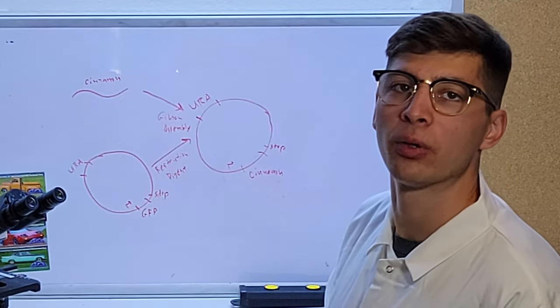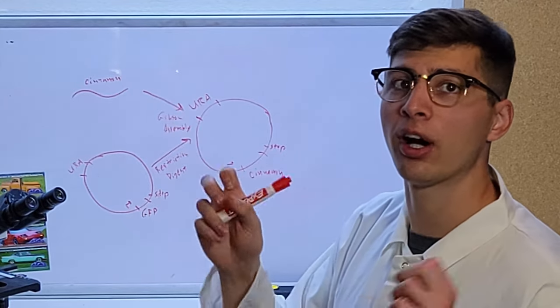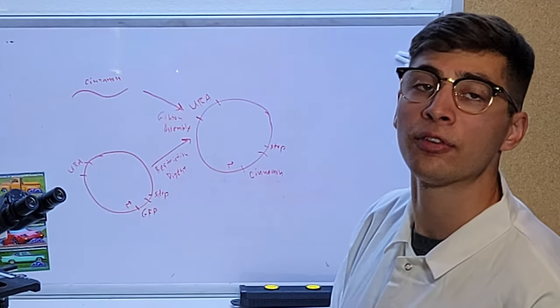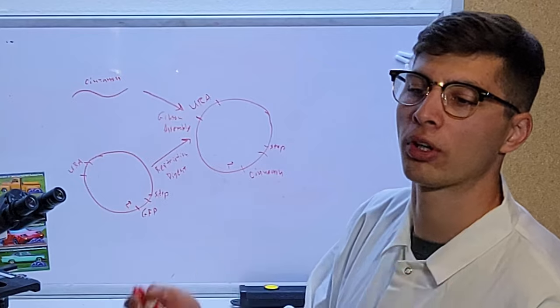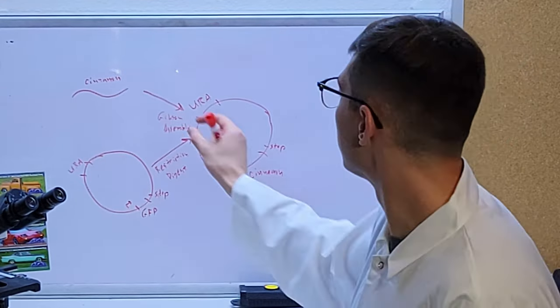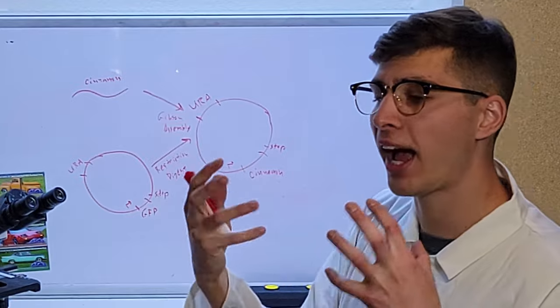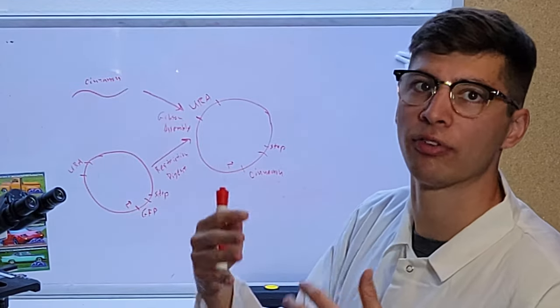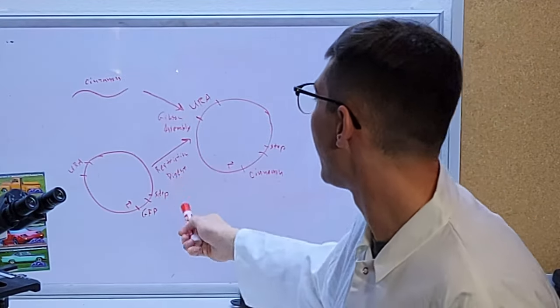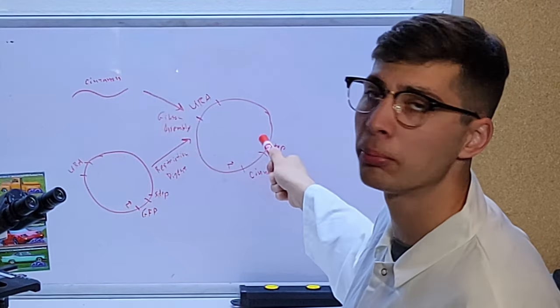However, we will have to do a little bit of work to find what the sequence of this gene is and then codon optimize it so that it can be expressed properly in Yarrowia. In a lot of cases, you aren't able to order the gene, or it's more cost effective to use another tool like PCR to design some primers around a particular gene, extract a DNA sample from another organism that has that gene, and just amplify it for use in your final plasmid. So anyway, we have our plasmid — we need to replace the GFP gene with our cinnamon gene.